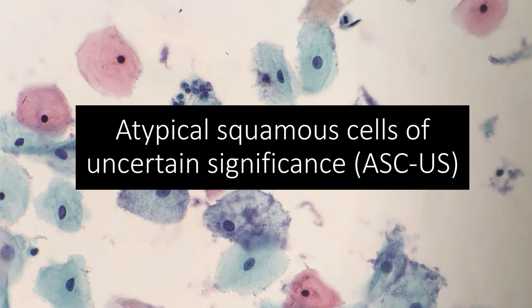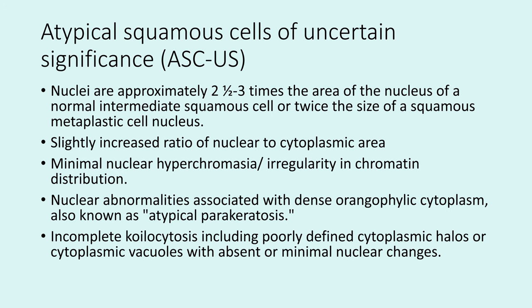Specifically for the ASCUS category, nuclei are approximately two and a half to three times the area of the nucleus of a normal intermediate squamous cell, or twice the size of a squamous metaplastic cell nucleus, with a slightly increased ratio of nuclear to cytoplasmic area, minimal nuclear hyperchromasia, and irregularity in the chromatin distribution. You can also see incomplete koilocytosis, including poorly defined cytoplasmic halos or cytoplasmic vacuoles with absent or suboptimal nuclear changes — changes that fall short of a low-grade diagnosis.